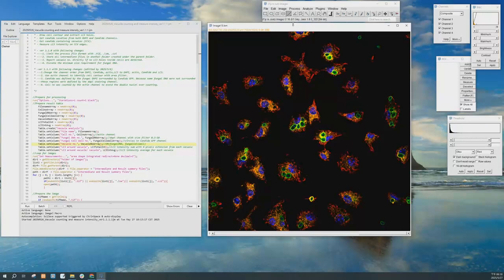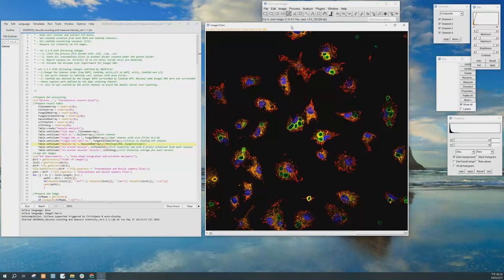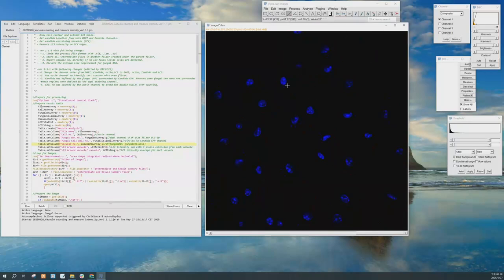So, if you want to perform the analysis, let's first see what kind of images you need to prepare. This image consists of 4 channels. The first channel is the DAPI channel. It stains not only the DNA in the cell nuclei. If you adjust the image contrast, you will notice that when we increase the contrast, you can see that besides the nuclei, the Candida genome is also stained by DAPI. We use these small DNA aggregates to determine the fungal DNA, which is Candida DNA, and how many clusters there are.